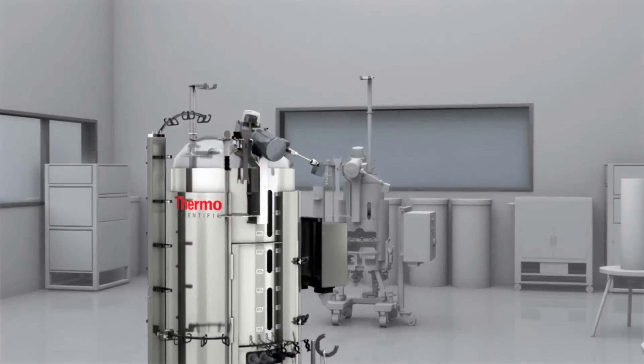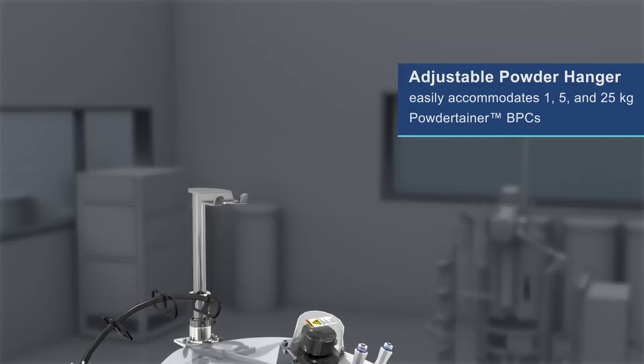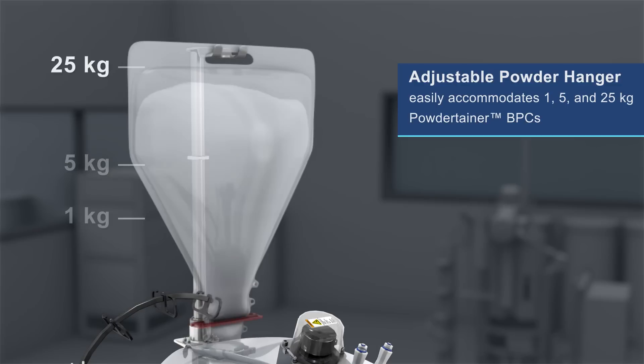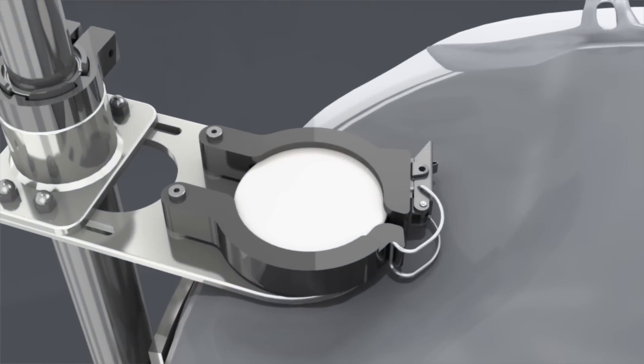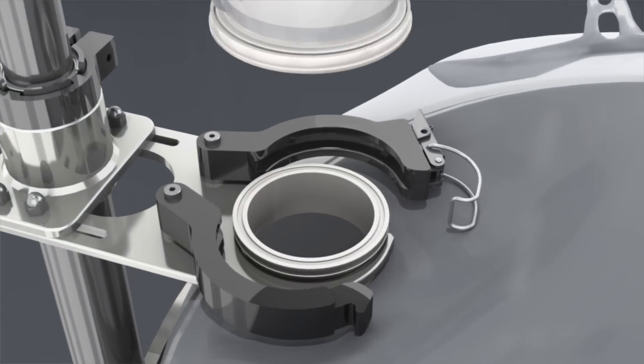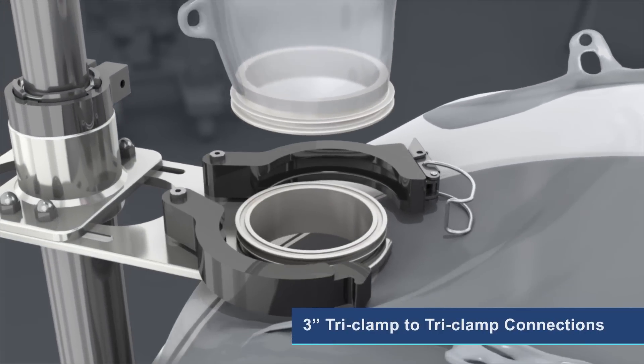The SUM's adjustable powder hanger easily accommodates 1, 5, and 25-kilogram Thermo Scientific Powder-Tainer BPCs, and positions the 3-inch tri-clamp connectors for bag-to-bag connection and solids transfer.